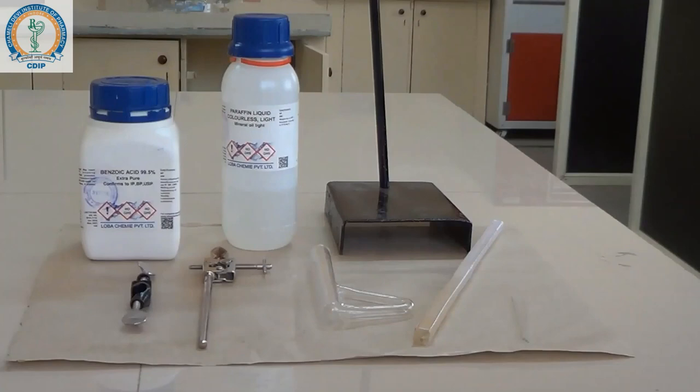Usually a small amount of impurity, whether miscible or partially miscible, produces a marked increase in the melting point range. Thus melting point is a valuable criterion of the purity of an organic compound. A sharp melting point indicates high purity of a substance.